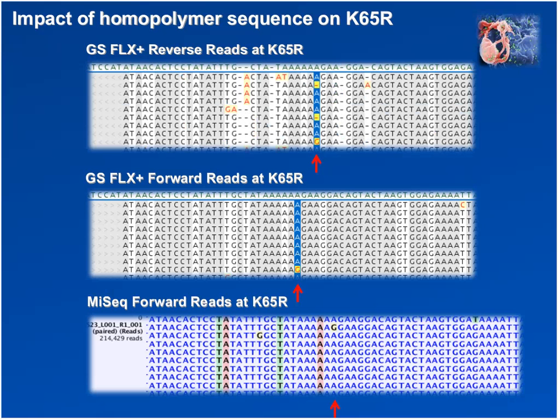We're going to switch to the other end of the target now and look at the drug-resistant site K65R. The reason is that we want to spend a little time on this particular site.